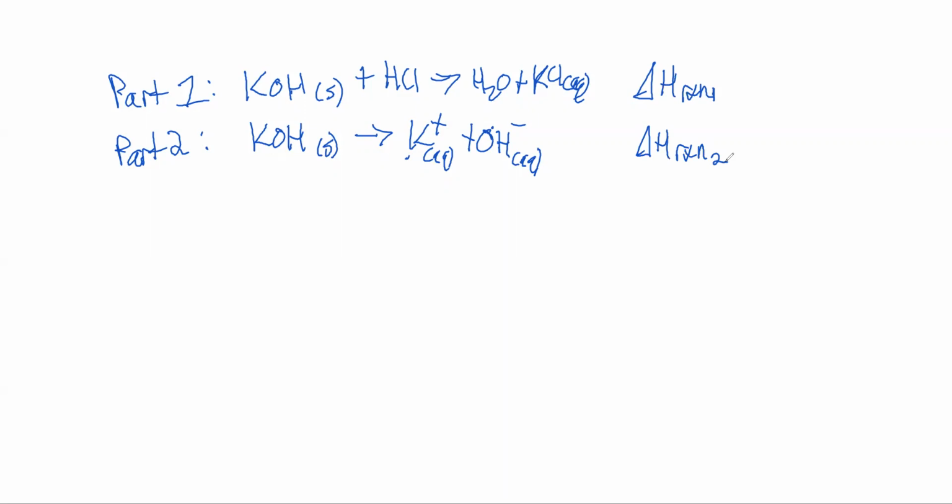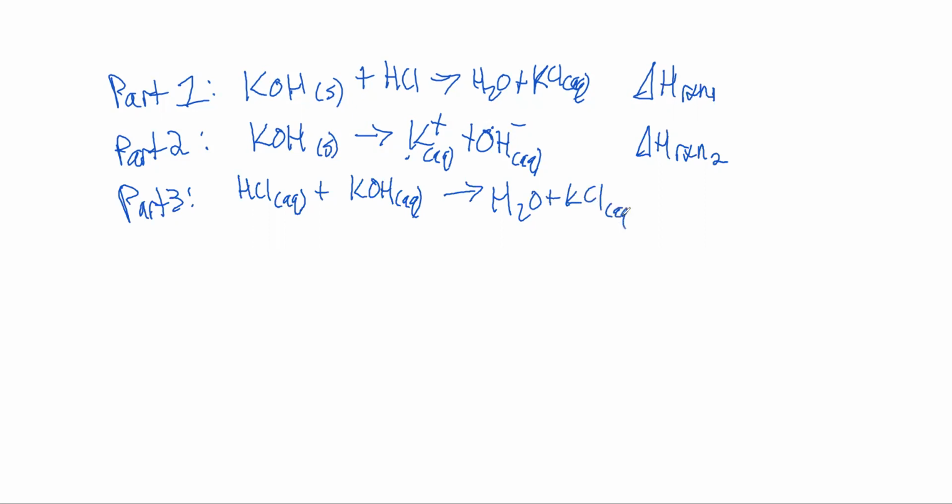And then we're going to use a third one where we're using our HCl and our KOH, that's aqueous, to make that water and that KCl, that's aqueous.